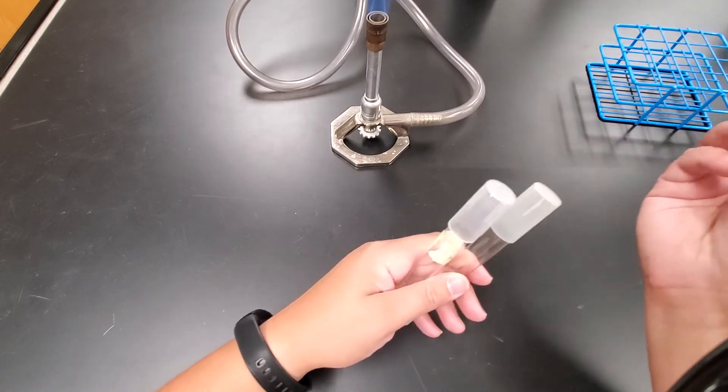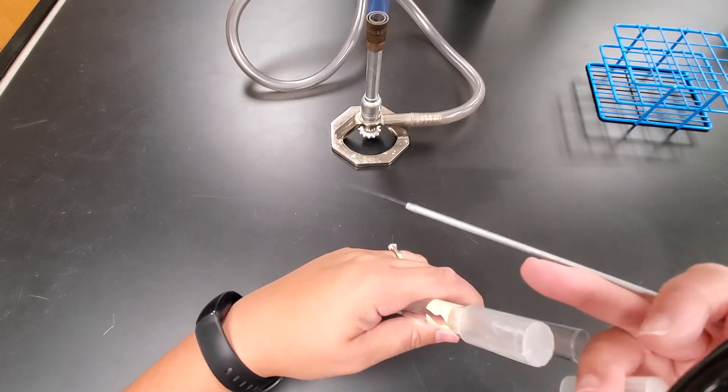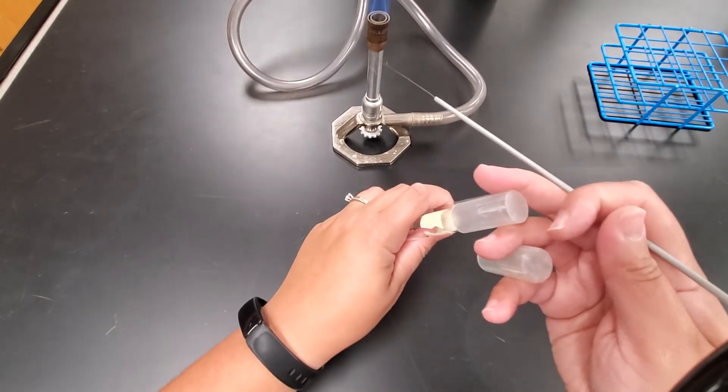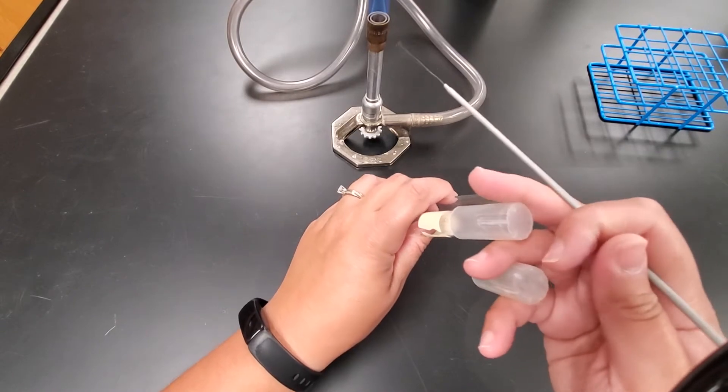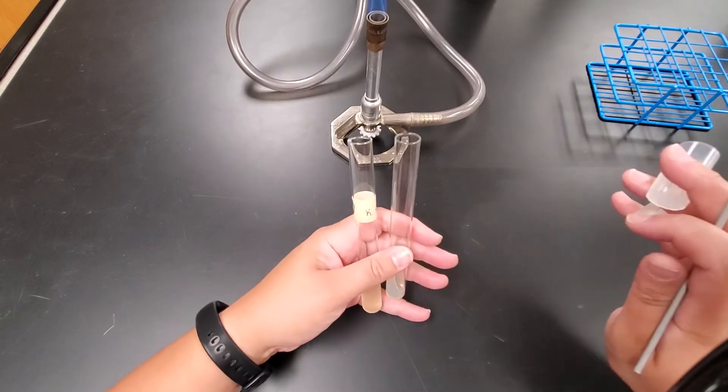What I need to do now is uncap these tubes. So I'm going to take one of the caps in between my pinky and my ring finger and another cap in between my middle and my ring finger. And you'll notice that the way I'm holding it, the caps are pointed away from me.